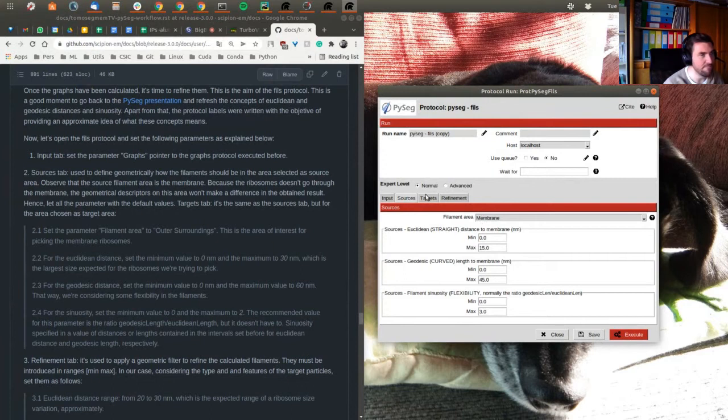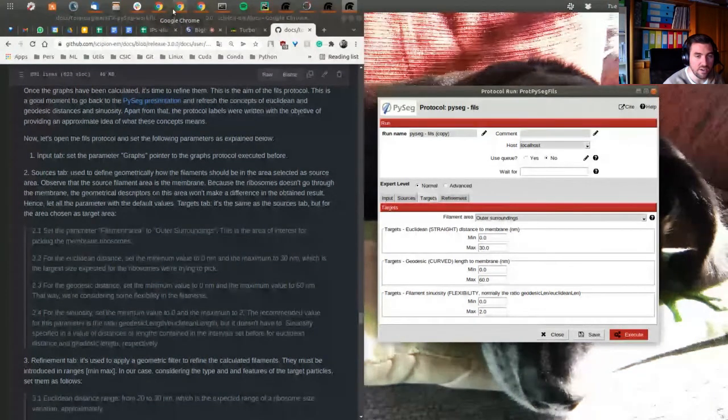Dimitri, no, the filament are... Sorry. Oh, no, it's okay.